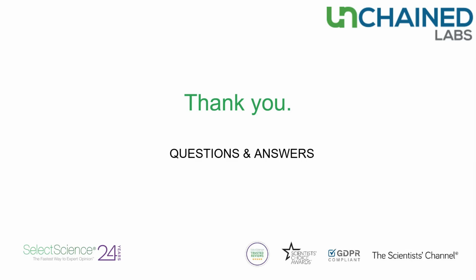Lovely, thank you. The next one we have is, could Stunner be used for others than ADCs? For example, for seeing if antibodies coupled to beads or to fluorophores used for immunoassays, or even the antibodies alone, are aggregated? So let's take the first part of the question first. Can Stunner be used to find out if an antibody is bound to a bead? I think that's going to be a little bit more tricky because most beads, as far as I remember, don't have a pronounced absorption of their own.